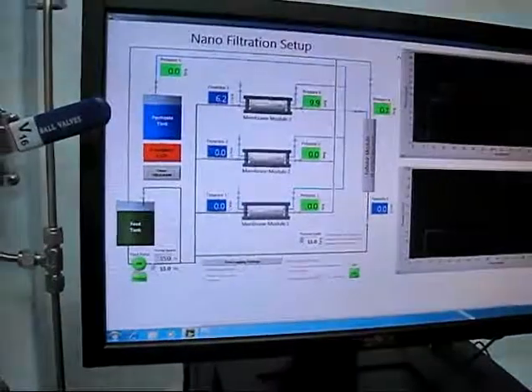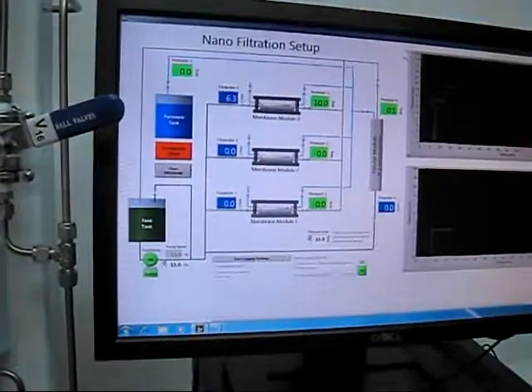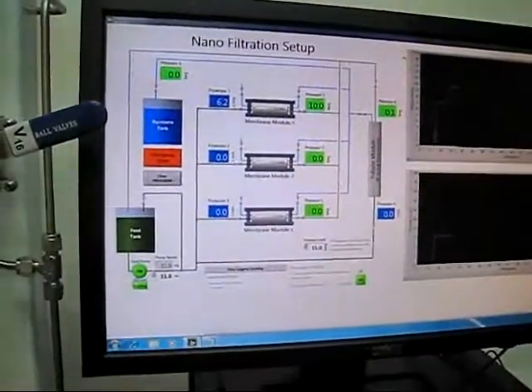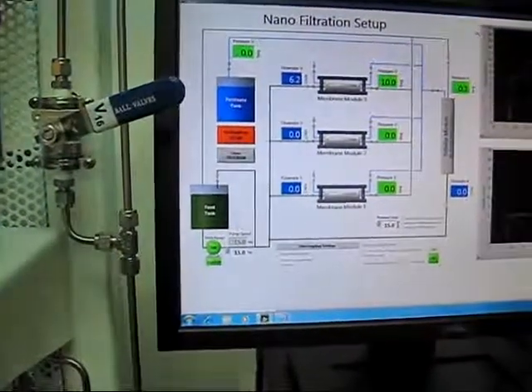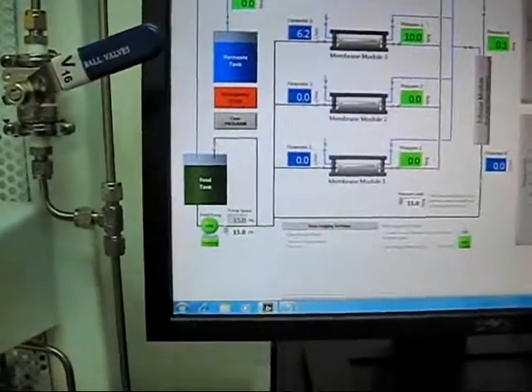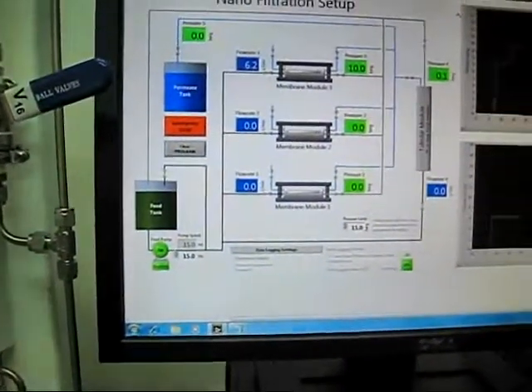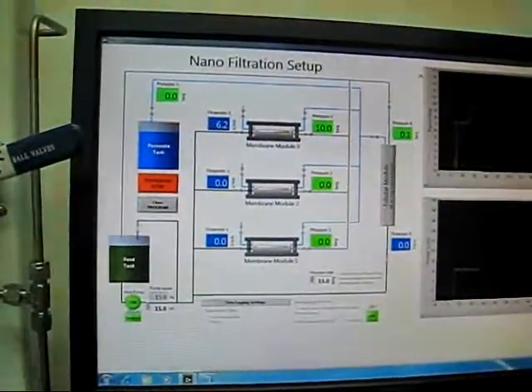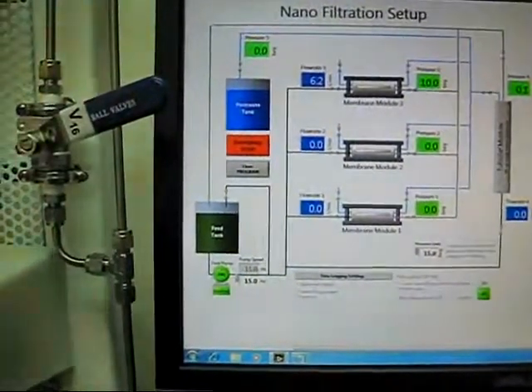I have 6.2 as my flow rate and 10 bar as my pressure, at 15 Hz. Now, if I want to increase the flow rate also at 10 bar, what I can do right now is to increase the frequency slowly.